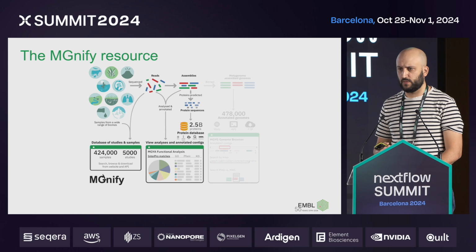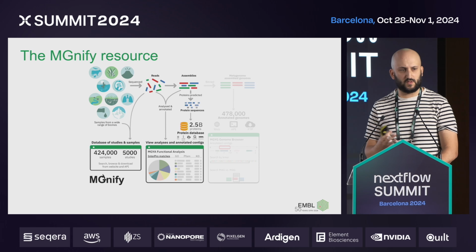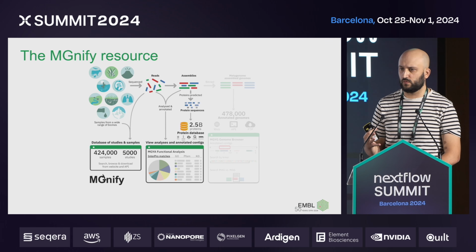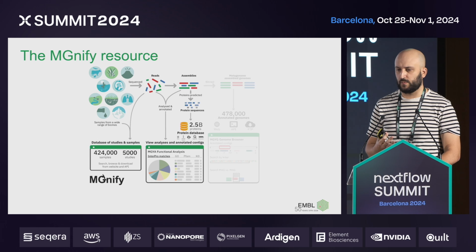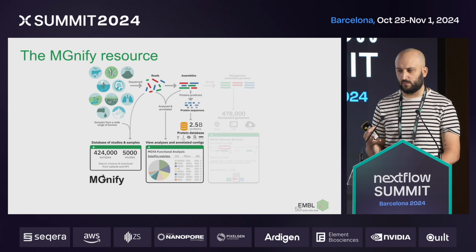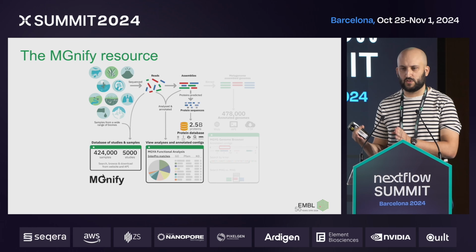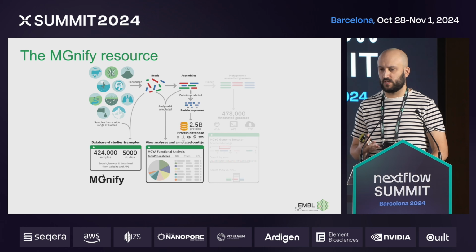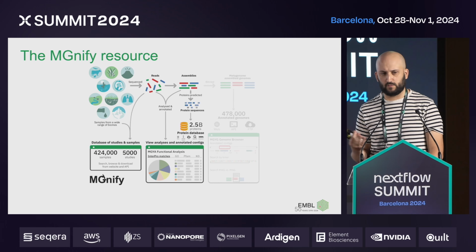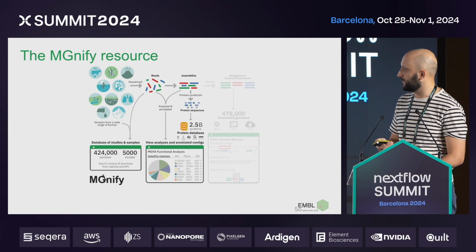One byproduct of this is that we collect all the coding sequences that we find in those assemblies. We have been collecting those proteins, as we call them, for the last 10 years, so we have generated a massive amount of data. We have 2.5 billion proteins already, and not just the coding sequences, we also have the provenance, so we know which country that protein comes from and which assembly and whatnot. This has actually been used by the Meta folks for the ESMFold.